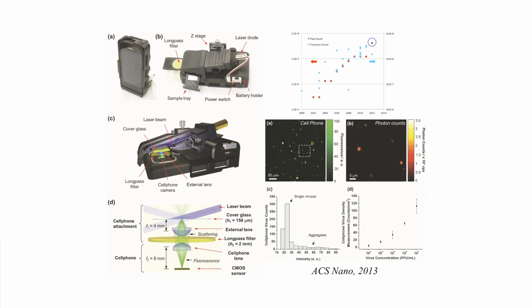That's a milestone for the cell phone itself in fluorescence, because fluorescence from a nanoparticle is very, very small, because a nanoparticle, by definition, is on the order of, let's say, 100 nanometers. It's below the diffraction limit. It's smaller than half the wavelength, and it doesn't emit a lot of light, because you're talking about labeling, which is not a lot of molecules there.